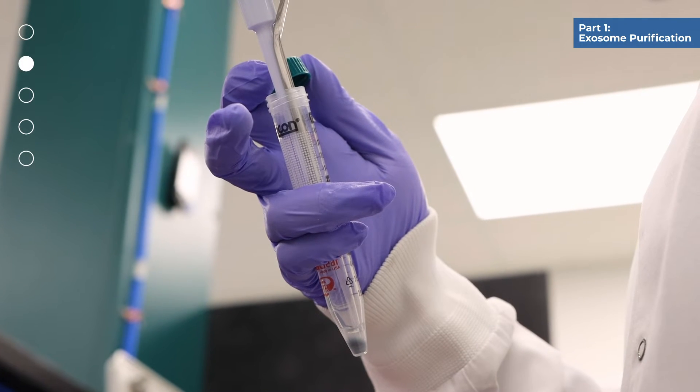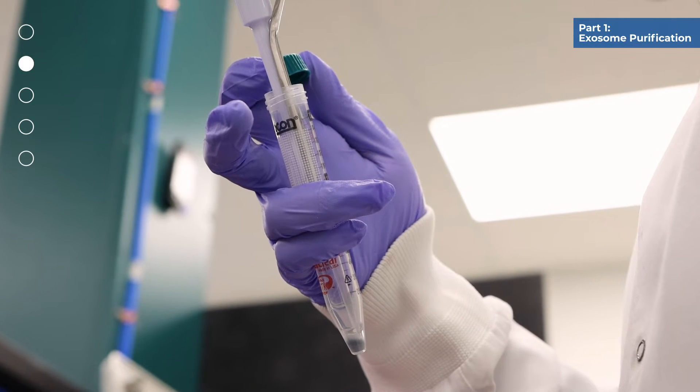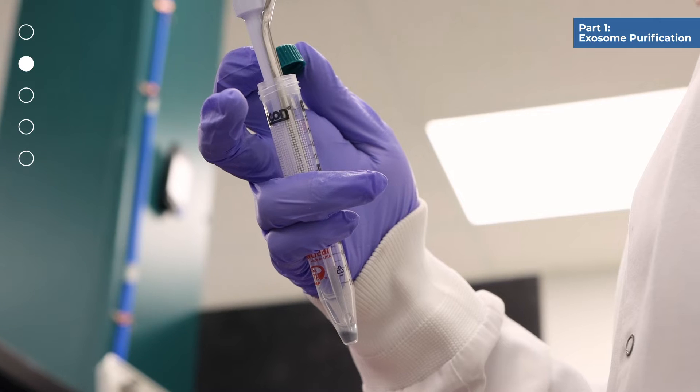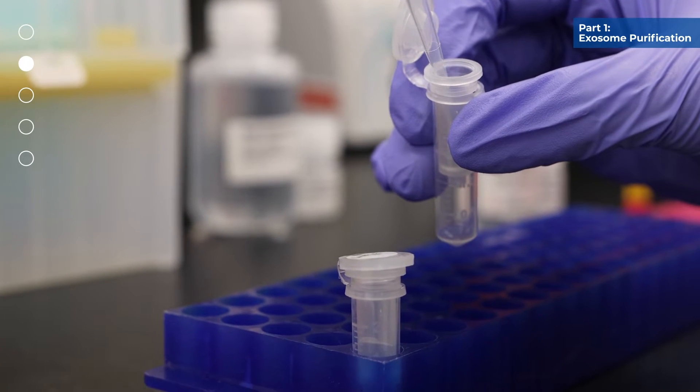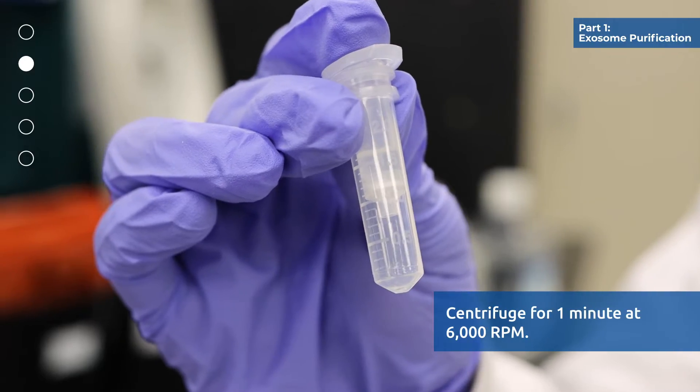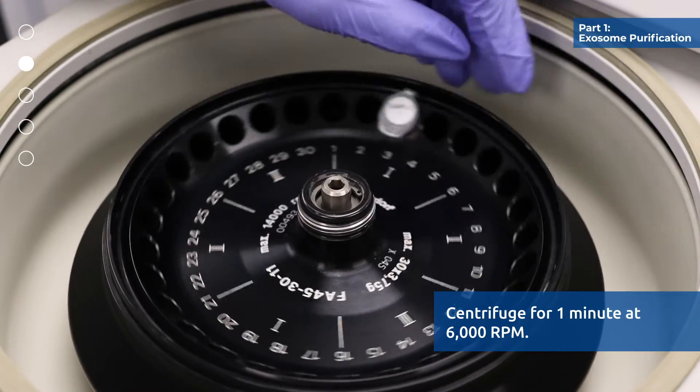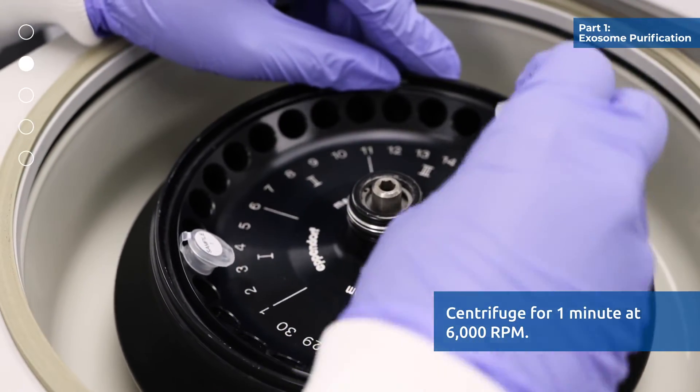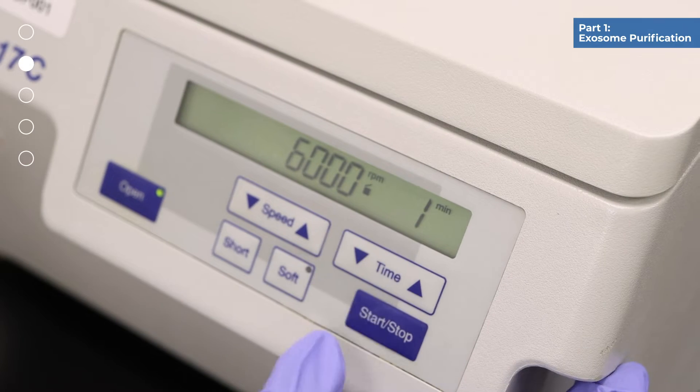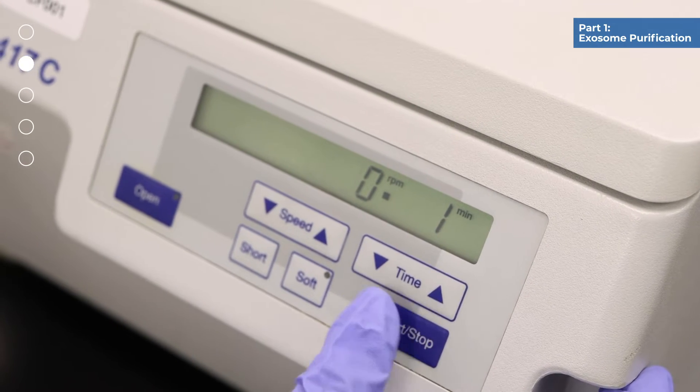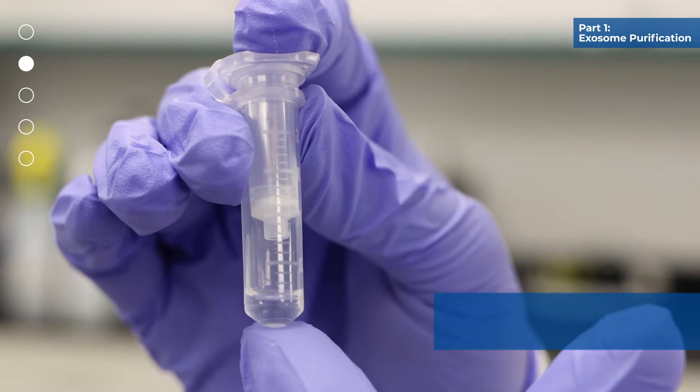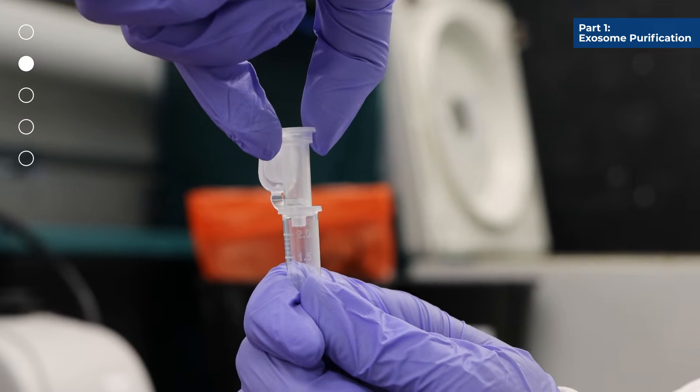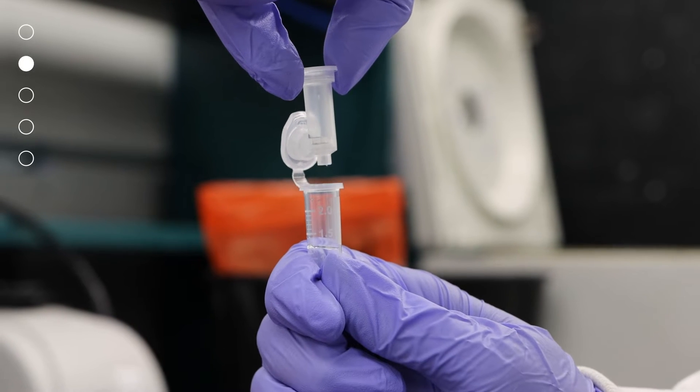Transfer the supernatant to a mini-filter spin column assembled with an elution tube and centrifuge for 1 minute at 6000 rpm. Do not discard the flow-through which contains your purified exosomes. Your exosomes are now ready for RNA isolation or any other downstream applications.